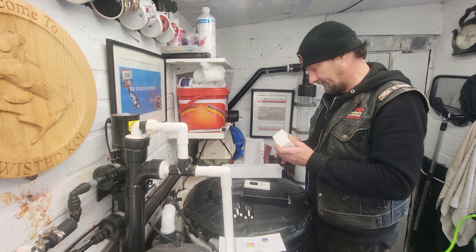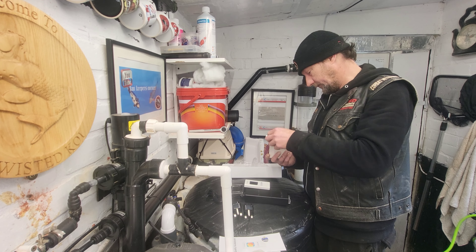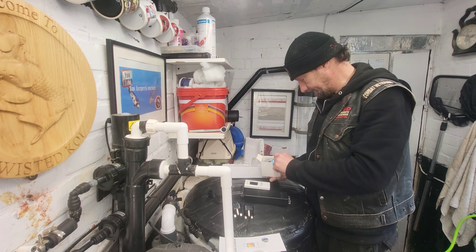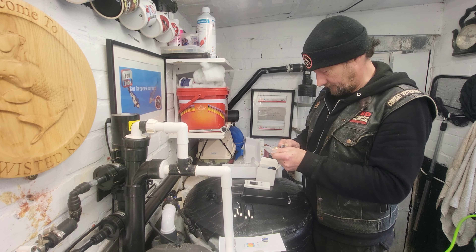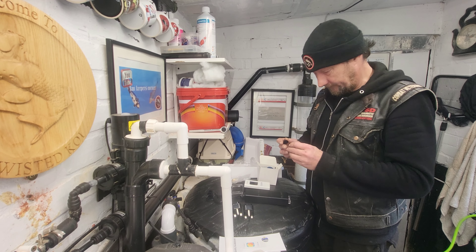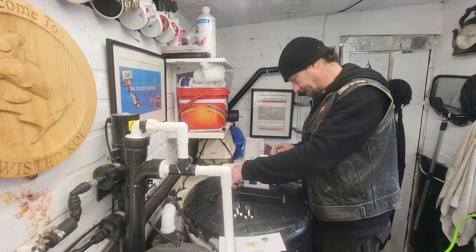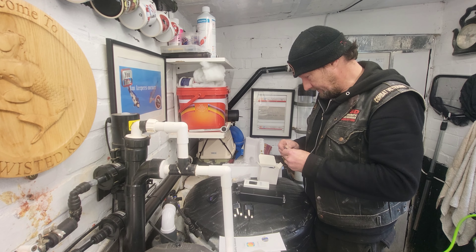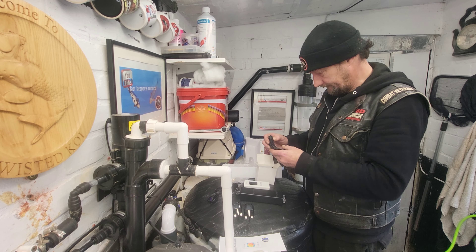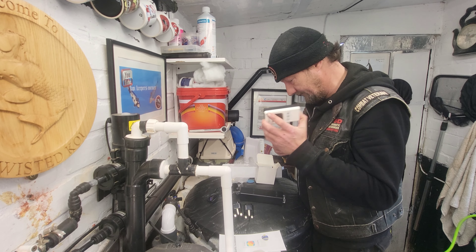In the next box, we've got some really strong magnets - two of them. Some suckers, which I presume go on the back. They must be for the magnets. And this must be the lead to connect in there.